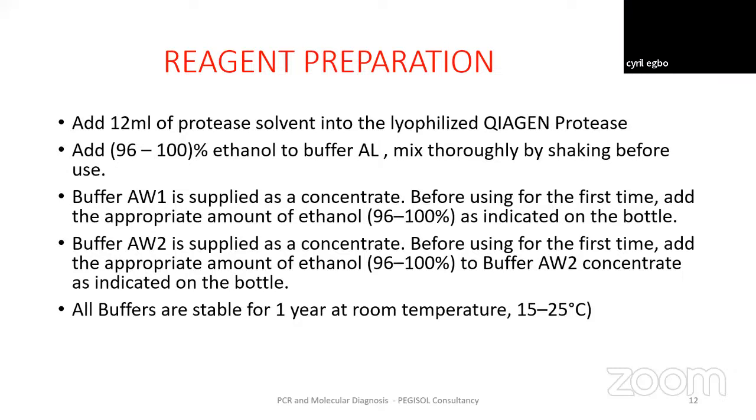Then there's buffer AW1, which is supplied as a concentrate. Before using it for the first time, you need to add absolute ethanol to the buffer.